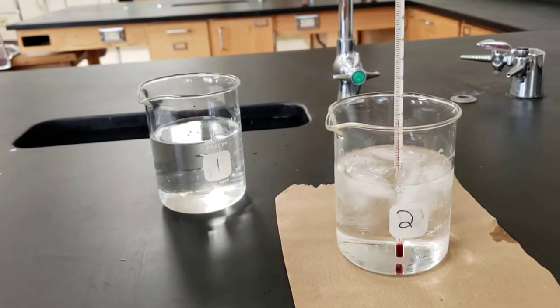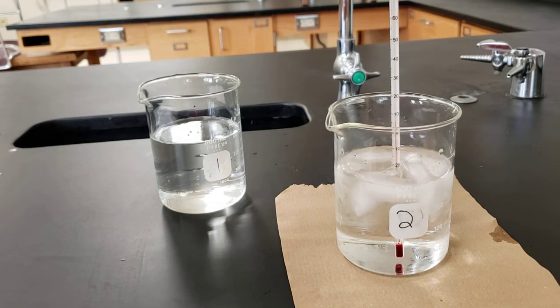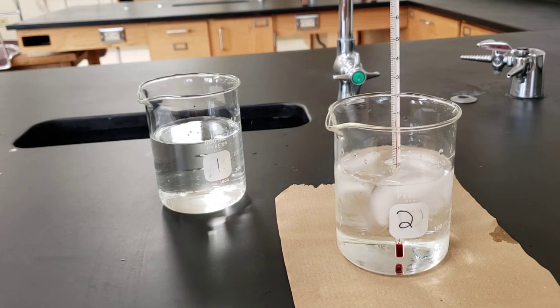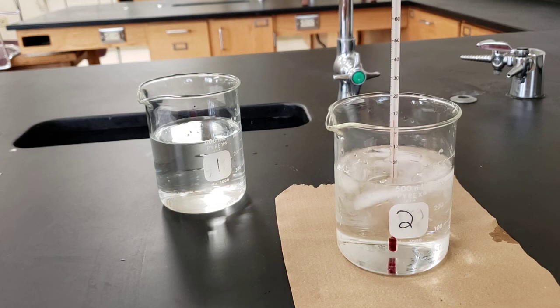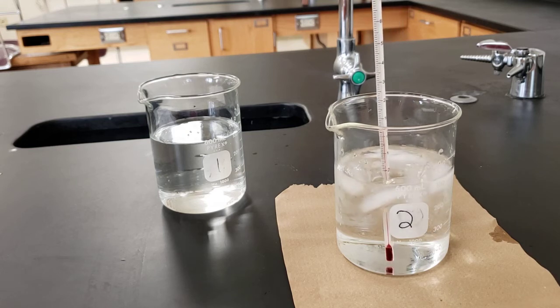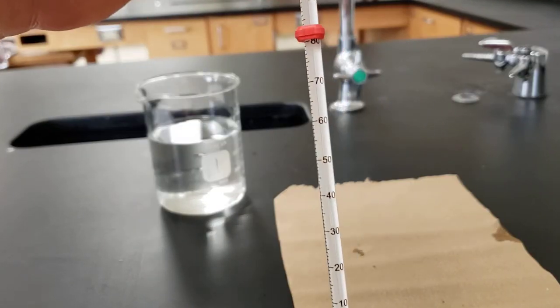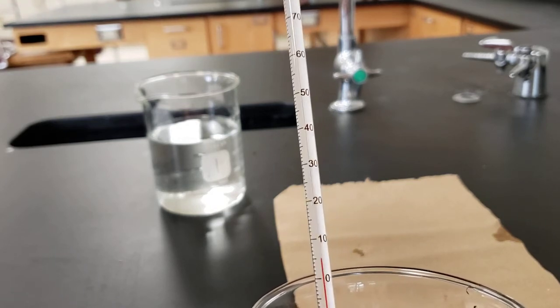I apologize for that focus. I messed up the focus on my camera trying to get this to do a close-up. All right, let's give it a few more seconds. It looks like the temperature has stopped changing, and I'm going to have to do this quickly so that it doesn't warm up too much once it's out of the beaker. So go ahead and read that temperature off of there.